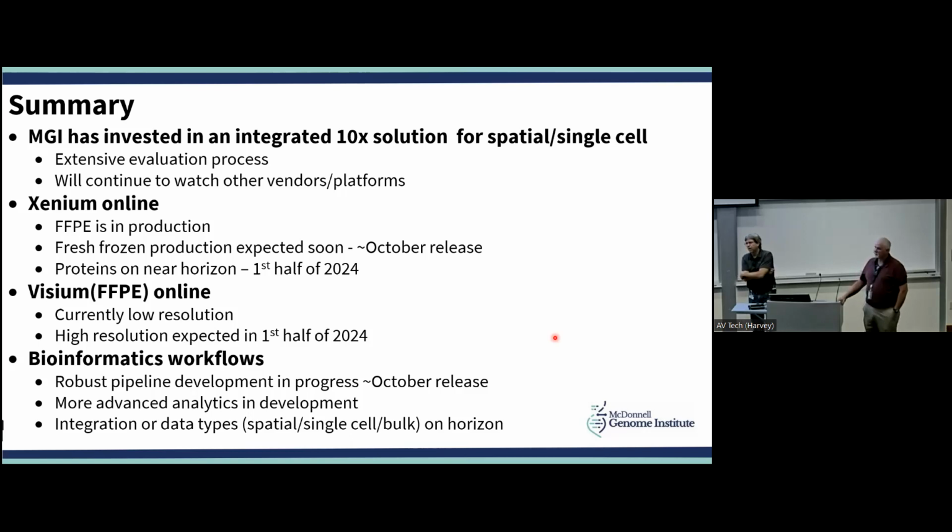No, I don't think they validate them. And that's why, if you remember, I was stressing, see if you can identify probes that have worked in the single cell space or other spatial work. They actually recommend using those because those tend to work at a fairly high efficiency rate. If you get outside of that space, you run the risk that the probes may or may not. Their design is good, but it's always good if you've got data somewhere that shows that those particular probes have worked in the past.